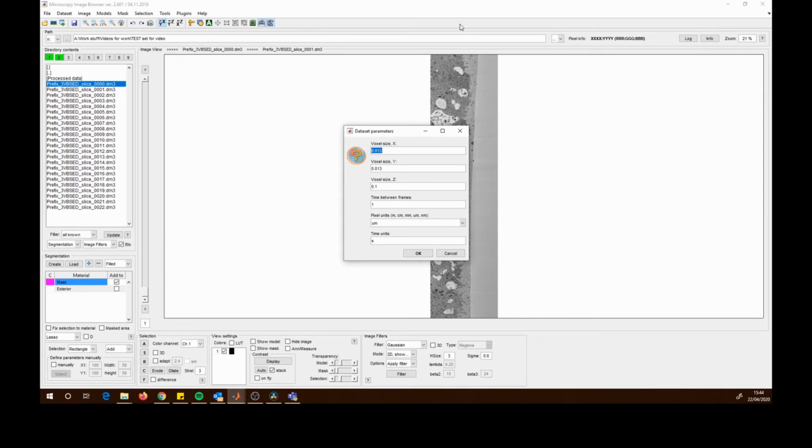In this case, we opened up the raw data, and our raw data from the 3View has the voxel sizes already included, so they're not just in a text file or something included with the image. So if you load up the raw data in this case, it will carry this over till you get to the point where you're saving your data. When the Bio-Formats library is used, it should acquire the pixel sizes automatically from the metadata.